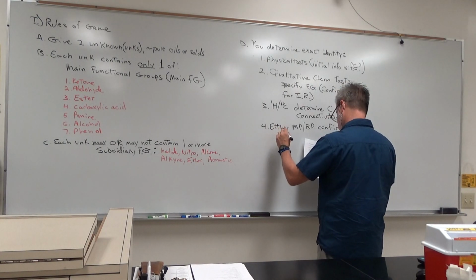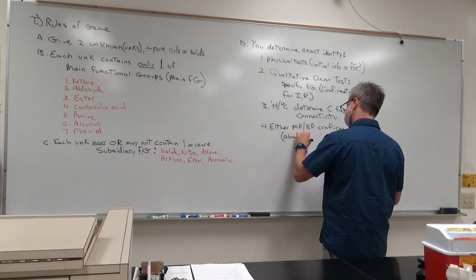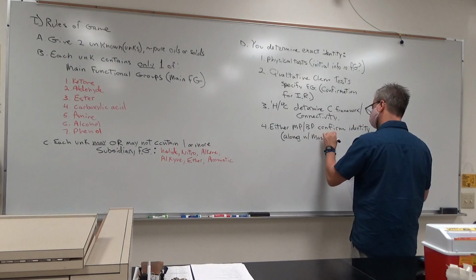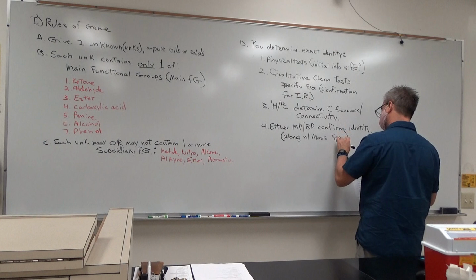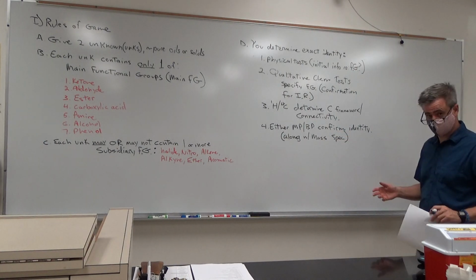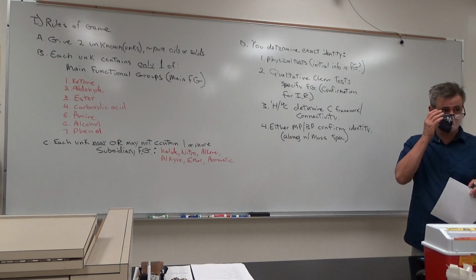You will get mass specs. There's a nice outline on page 455 of how this whole process works.